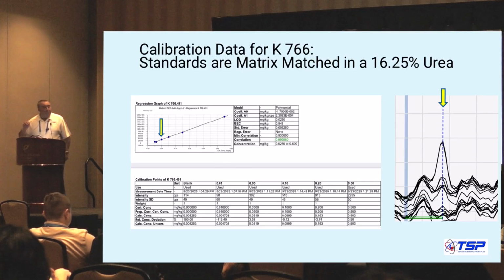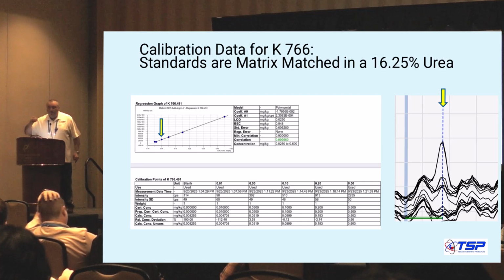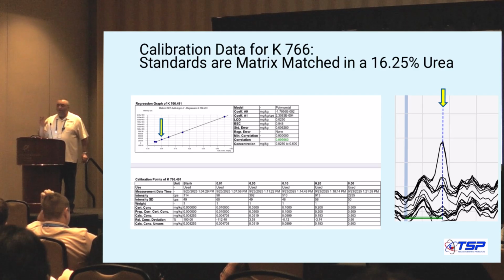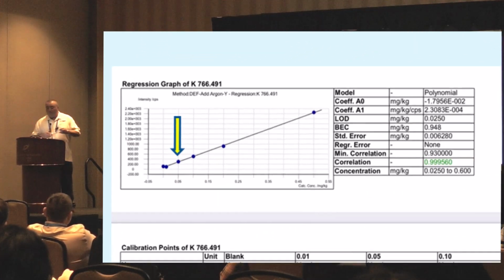So, briefly, performance. In some applications, you don't just need to worry about clogging your nebulizer or salting it up, but in addition to it, you need to hit your detection limit. So this is where you need not just a robust nebulizer, but one that gives you good sensitivity. And that's a real challenge for all high TDS capable nebulizers.